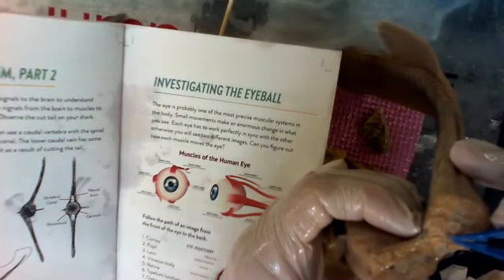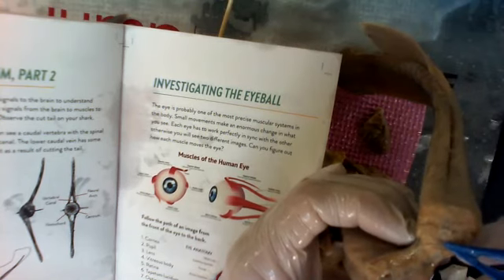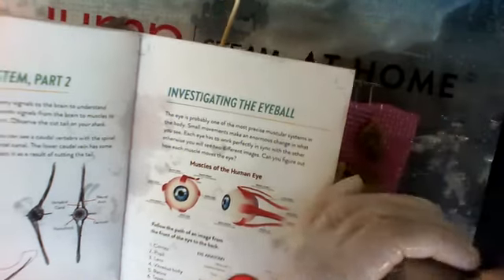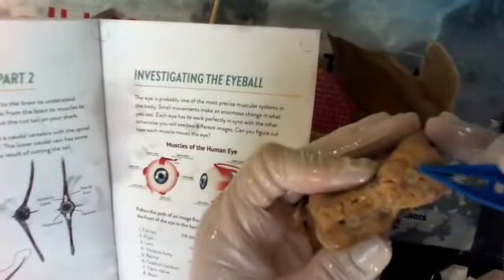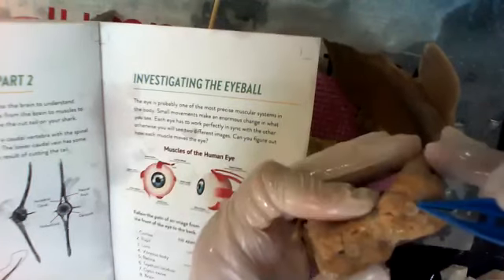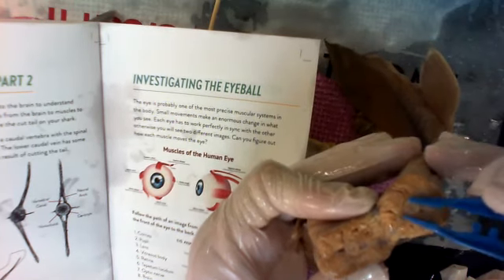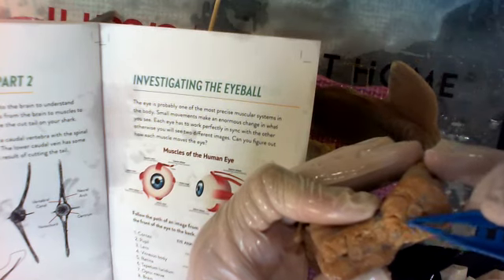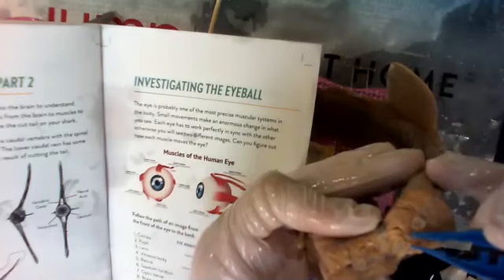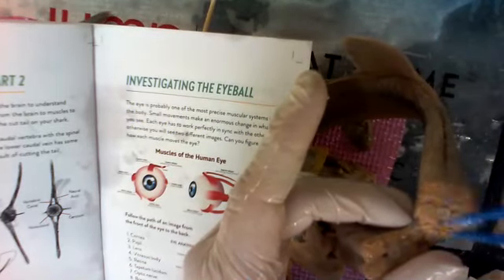This hole up here on this side is a spinal cord. You can kind of see a little bit of the mushy spinal cord in here still. Below, so this is the tail and this is the bottom of the tail. Below down here, you can see two holes. One's an artery and the other one's a vein. Okay, so you have an artery and a vein. You have the body of the vertebra, which gives it shape and structure. You have the spinal cord that pokes out just above it right there, in that little tiny hole. And then you can see the muscle groups that are attached. So all these flakes are actually groups of muscle.